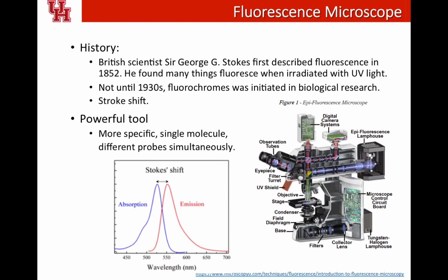It is more specific. You know what you are looking at because you label it, and you can use it for single molecule detection or imaging. You can also label different targets with different probes simultaneously, so you can image multiple targets.